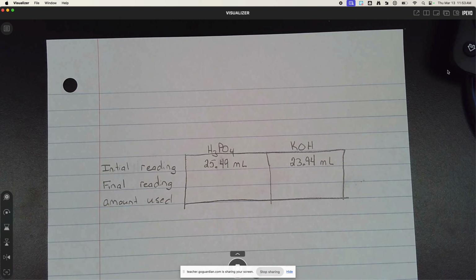It's slightly better to do this, however, in the other direction, only from the perspective of it is much easier for the human eye to detect when a color appears for the first time than the exact moment at which the color finally disappears. So if you went from the pink to clear, you certainly did just fine. That's where most people start. However, you'll get slightly better results if you go the other direction. And that's the direction we're going to go.